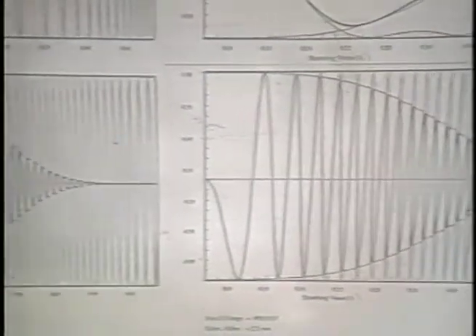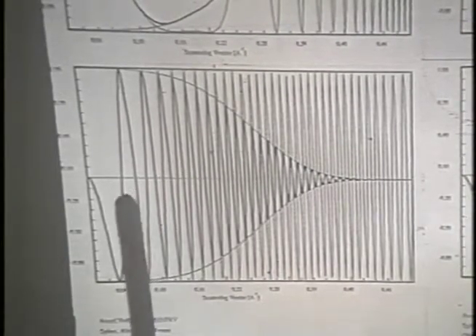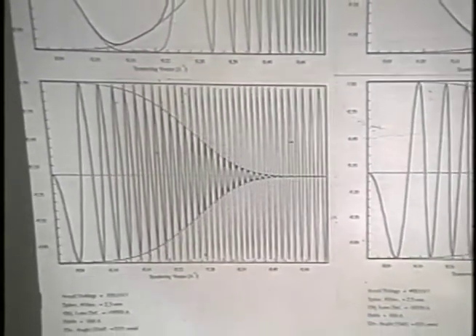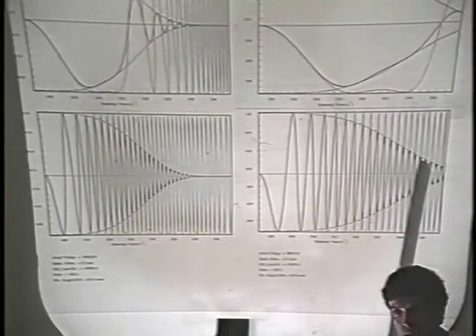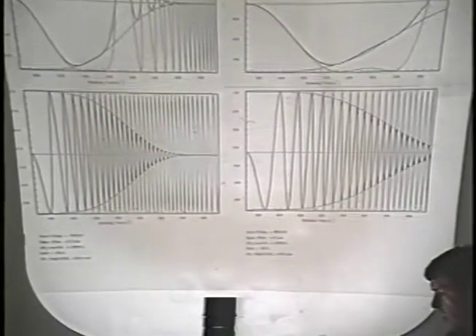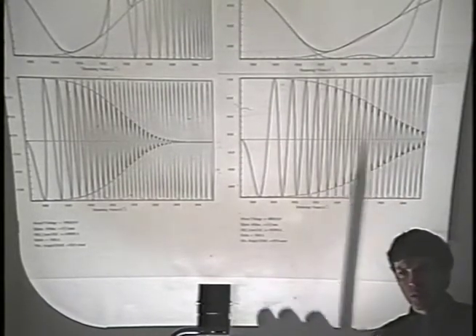Aside from extending the range at which the first 0 in this function happens to higher resolution, when we finally get into processing our images in the computer, we compensate for these oscillations in the transfer function. And with far fewer oscillations at high voltage, it makes life not just easier, but there's a limit to how many of these oscillations we can deal with or how close they can be spaced.